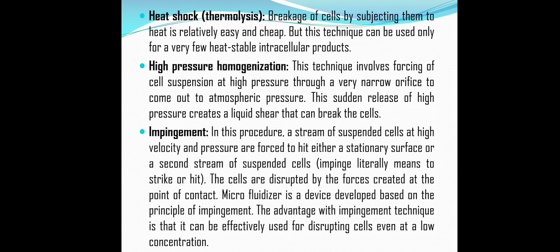The microfluidizer is a device developed based on the principle of the impingement method, and the advantage of this technique is that it can be effectively used for disrupting cells which are at a low concentration.